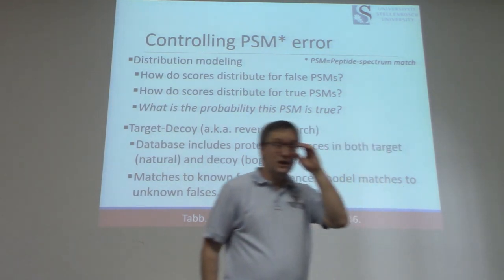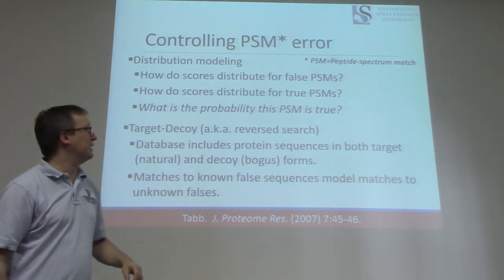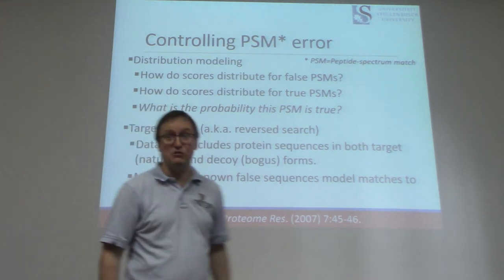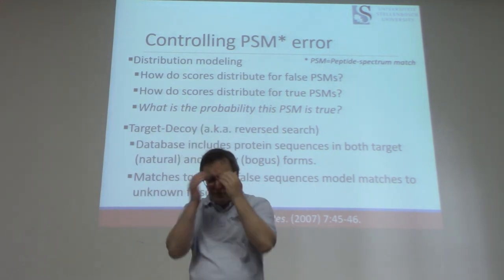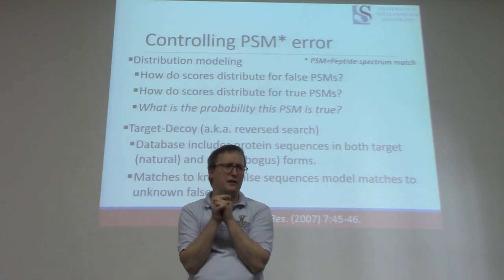Great. So you see that I've defined it on the next slide. I kind of jumped ahead by one. Sorry about that. So we have a whole pile of these. Remember that this one experiment may have produced a million tandem mass spectra if you have enough files that you've all jammed together.